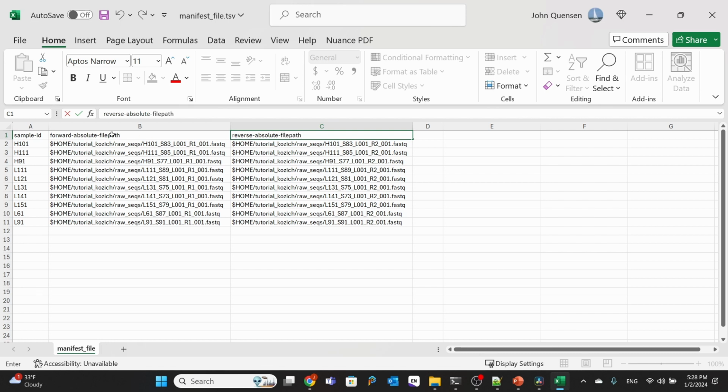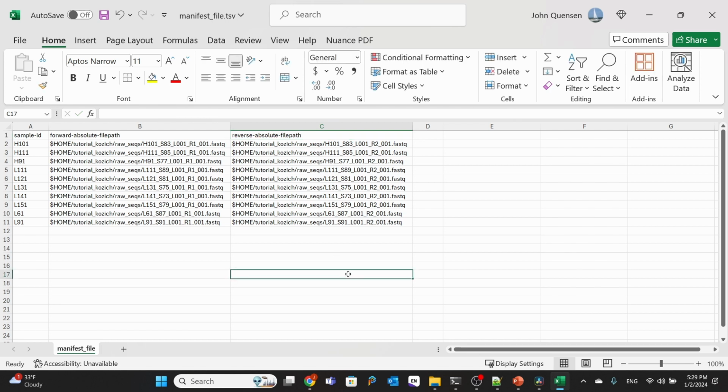And check that you don't make any spelling mistakes or typos, because if you do, it won't work. Okay, looks good. So now I will save that.